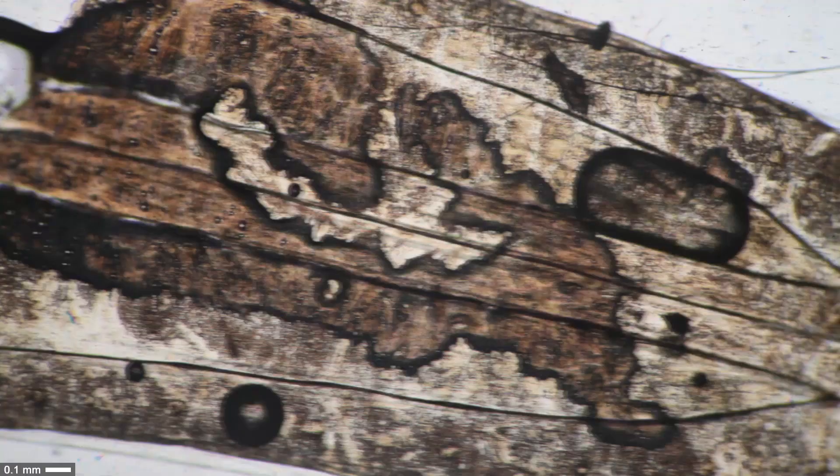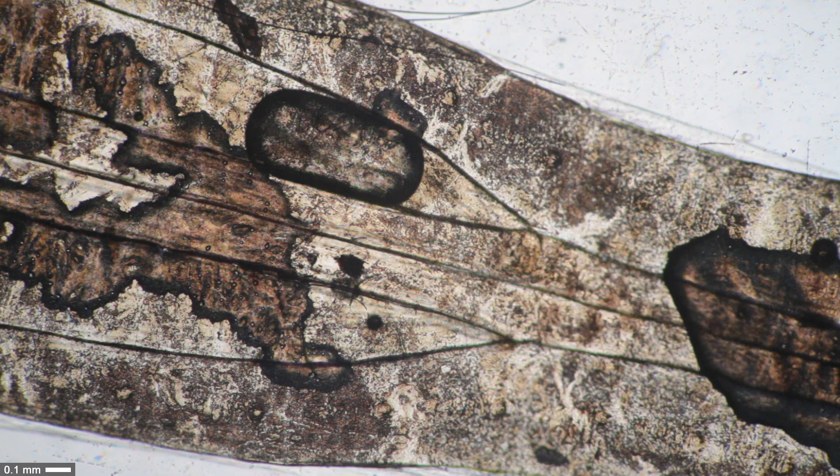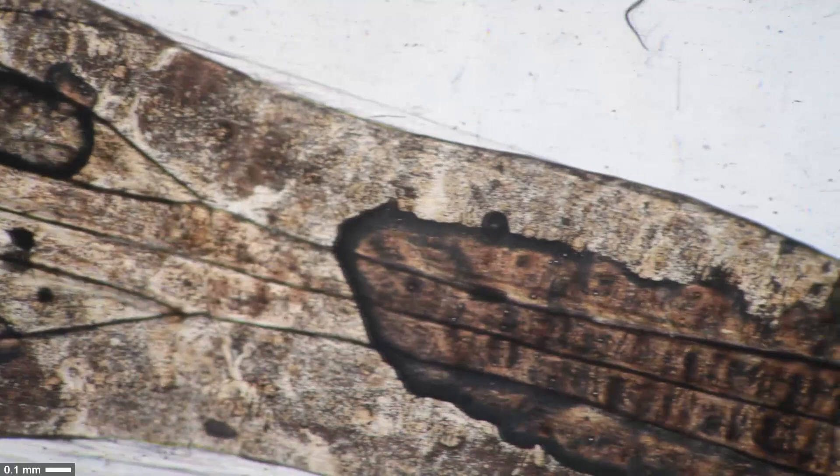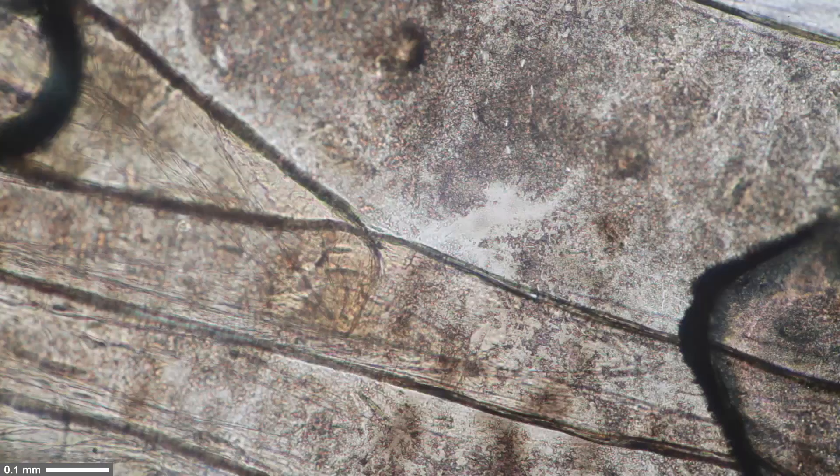Now I'm showing you the contrast. This is now in water, and you can actually see many more details here. Again, the oval structure is an air bubble. But overall, it's much less transparent. I think the reason is because the water was not able to infiltrate the shell very well, so there is a larger difference in refractive index. Slightly higher magnification. Again, you can see more structures here. This was the field diaphragm that I was closing to see if this has an impact.